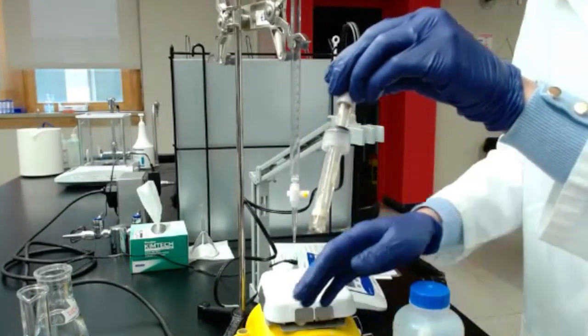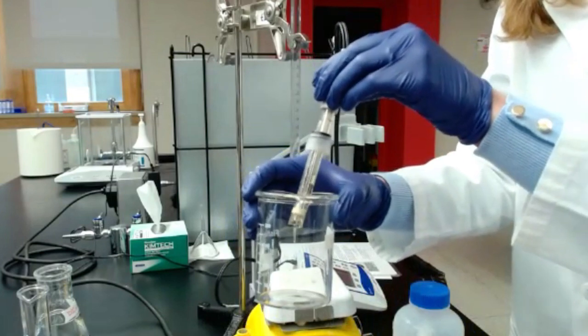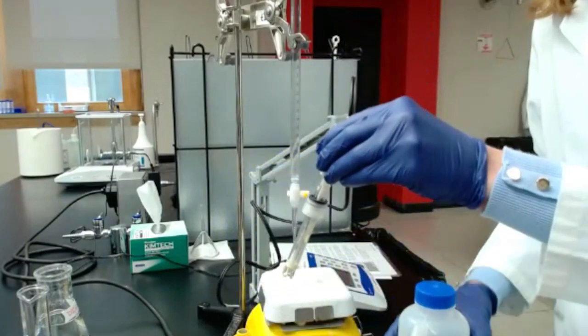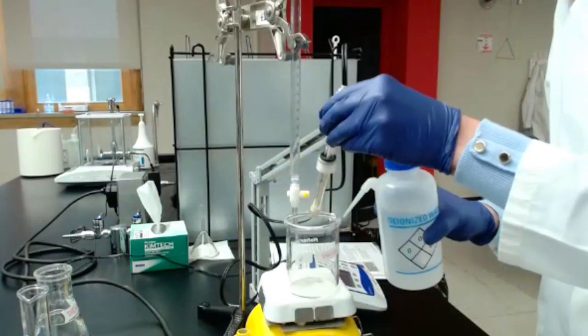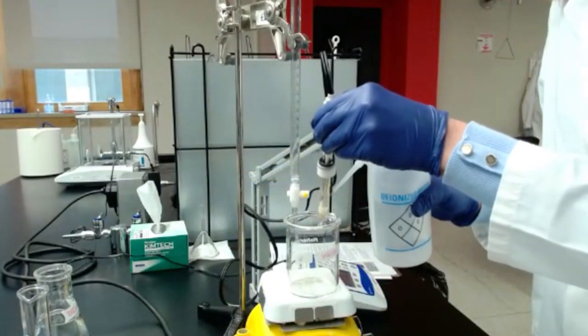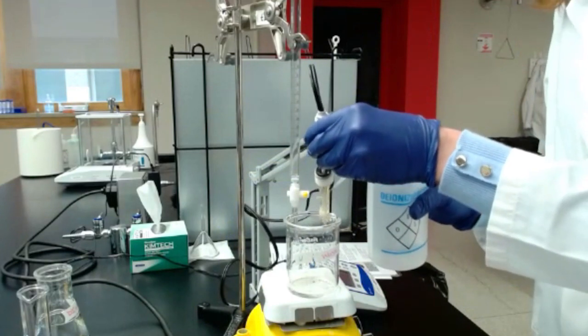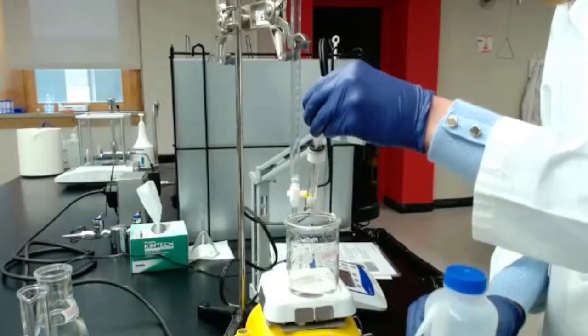To rinse, you need a waste beaker to gather all the liquid. All right, so I'm going to rinse first. Make sure you don't put water anywhere else except for rinsing.